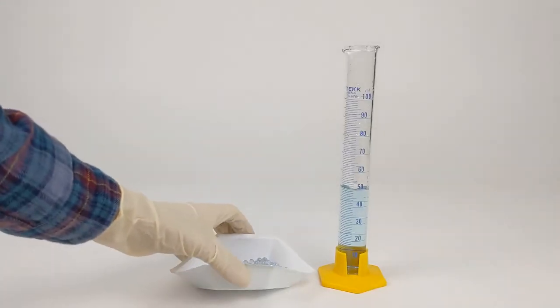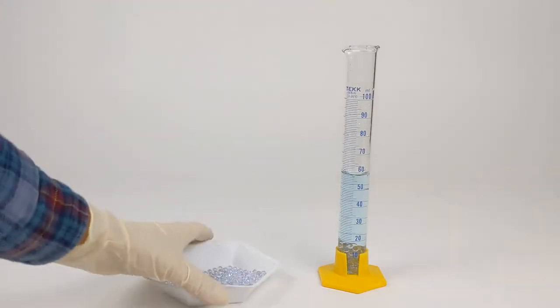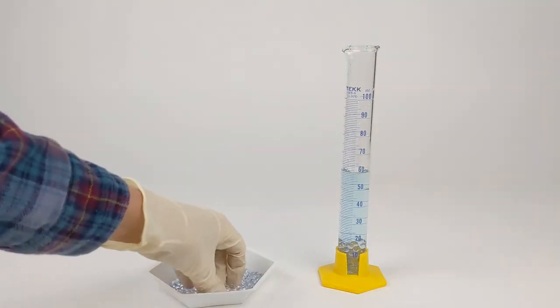Lastly, we're measuring out glass beads to go in the third vial. We want 11 milliliters of glass beads, which is the same as our volume of germinating beans. So this will take us from the 50 milliliter initial volume of this graduated cylinder to the 61 milliliter mark as we add more glass beads.